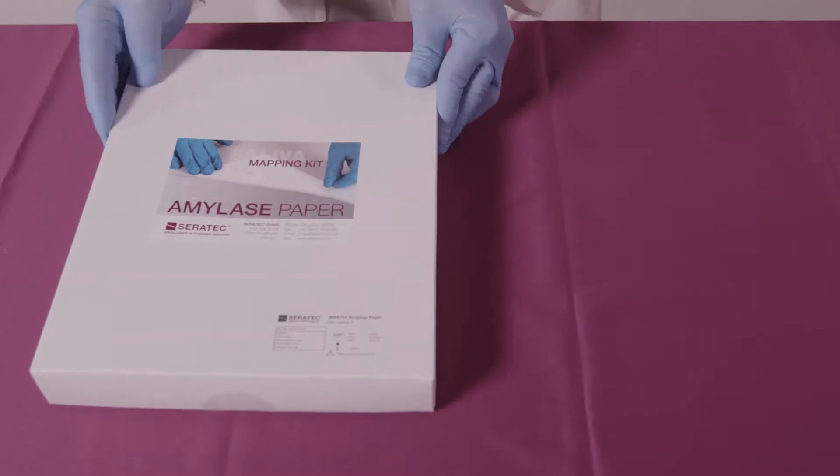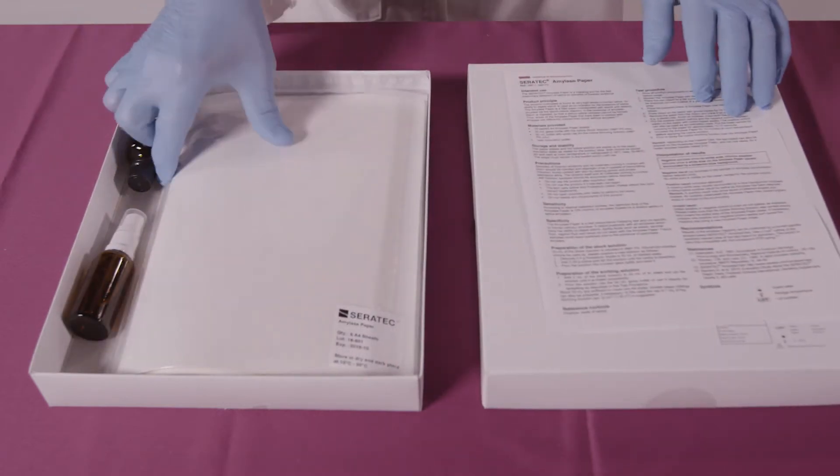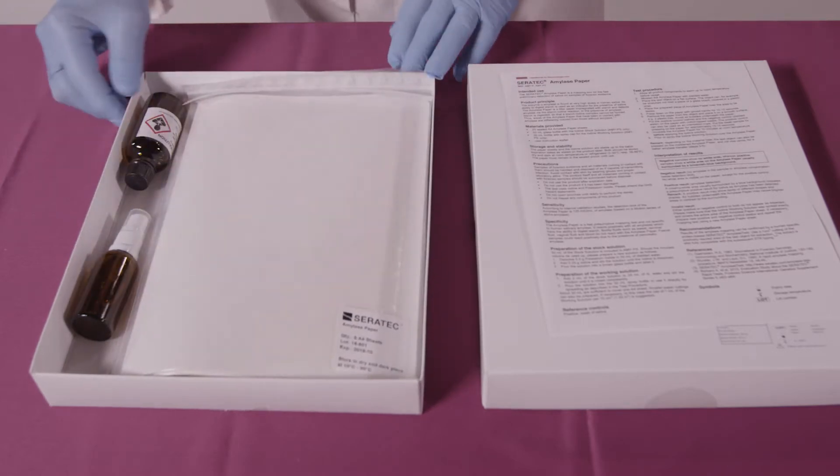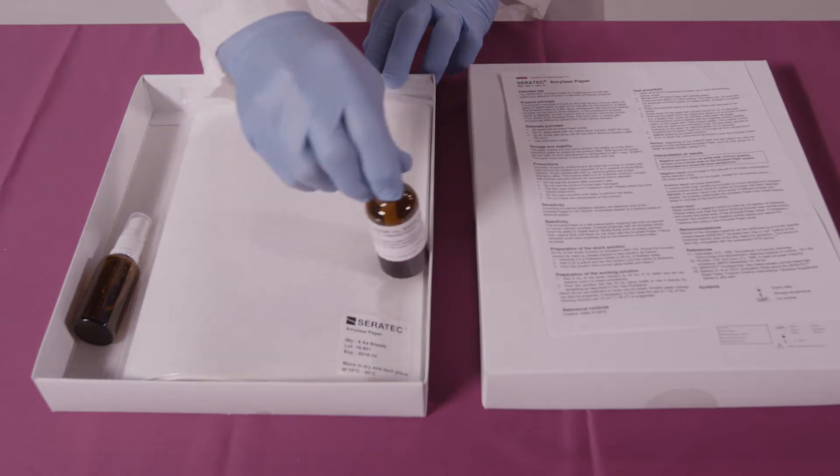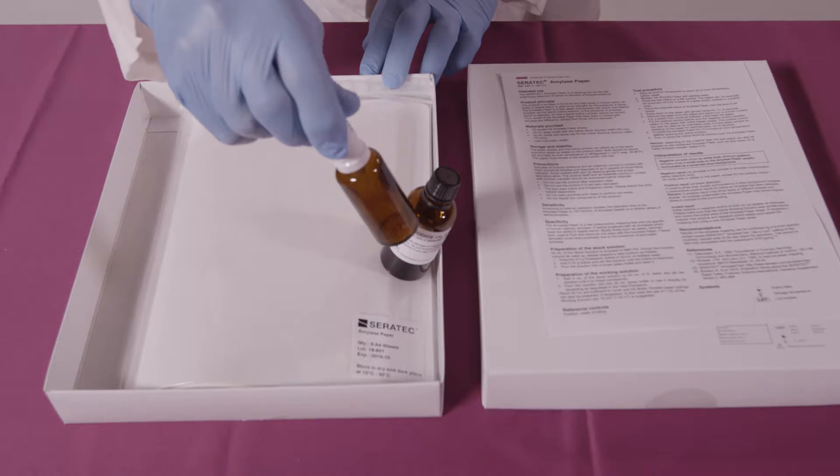The Ceratec amylase paper kit contains an instruction leaflet, 25 sealed amylase paper sheets, 50 milliliter glass bottle containing iodine stock solution, and a 30 milliliter plastic spray bottle for application of the working iodine solution.